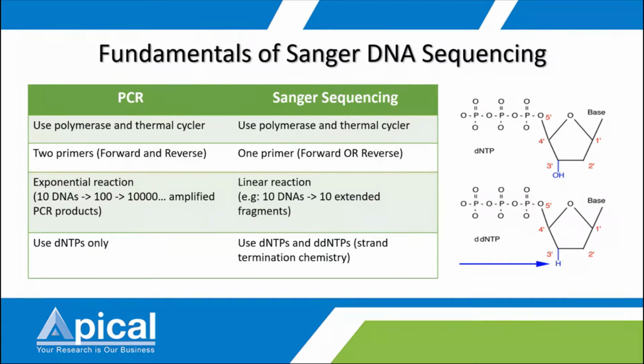It is because the priming efficiency is different. So that is the difference between PCR and sequencing.